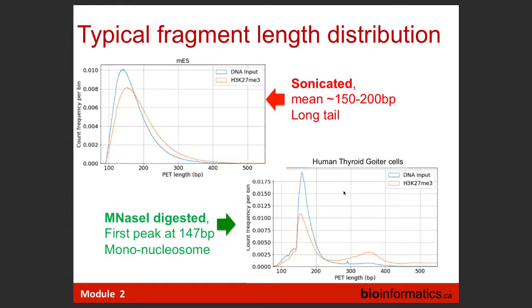Normally, you would like that. Sometimes around 200 bases, 150, there is a mode of this distribution, and everything winds down at 300. What is critical for us when we look at a distribution like this, this is paired-end? When we have several samples and would like to compare them, we would like those distributions to be as similar as possible. If they're different, then we will pay the price, because this is essentially what gives us the resolution of our experiment.